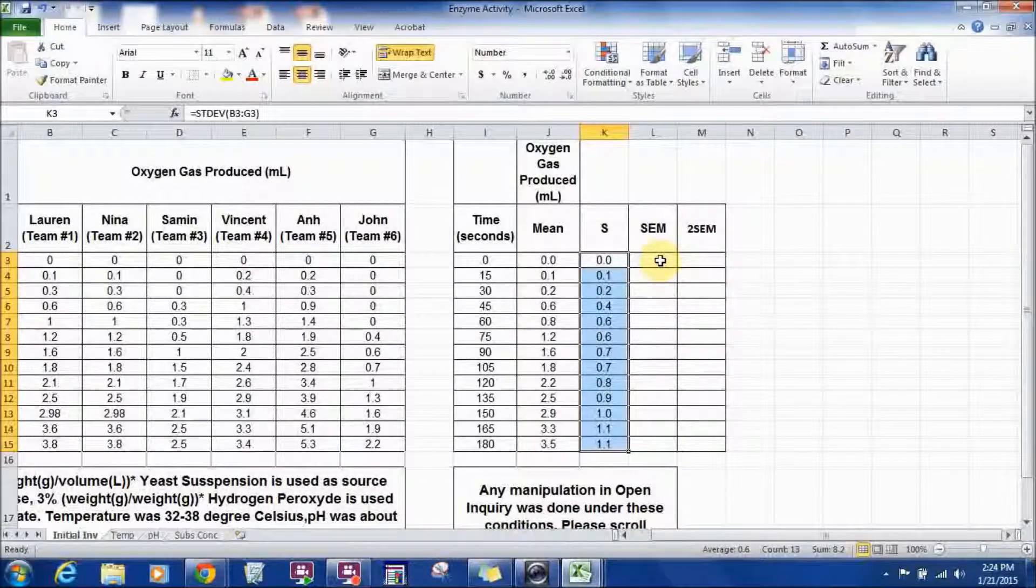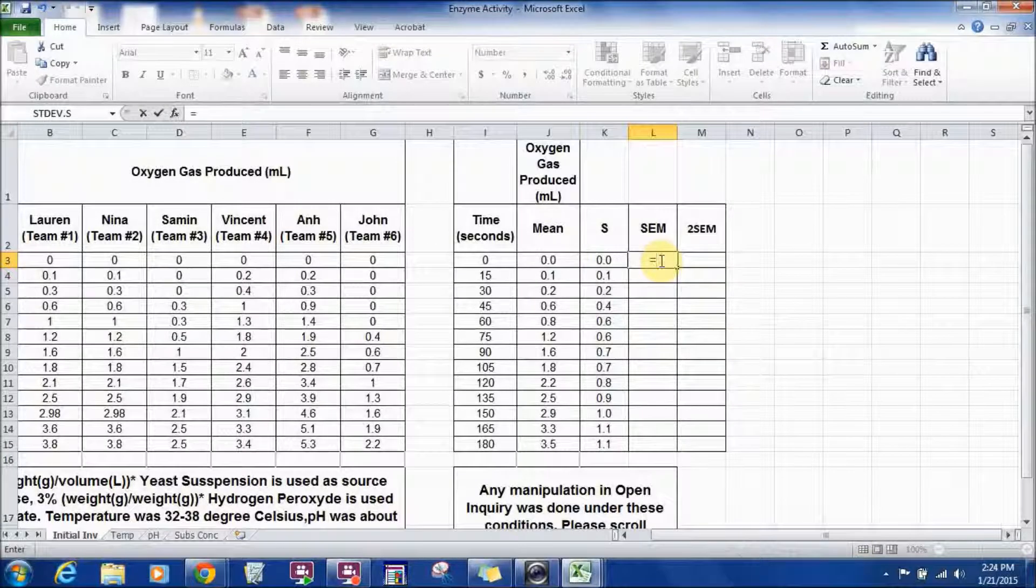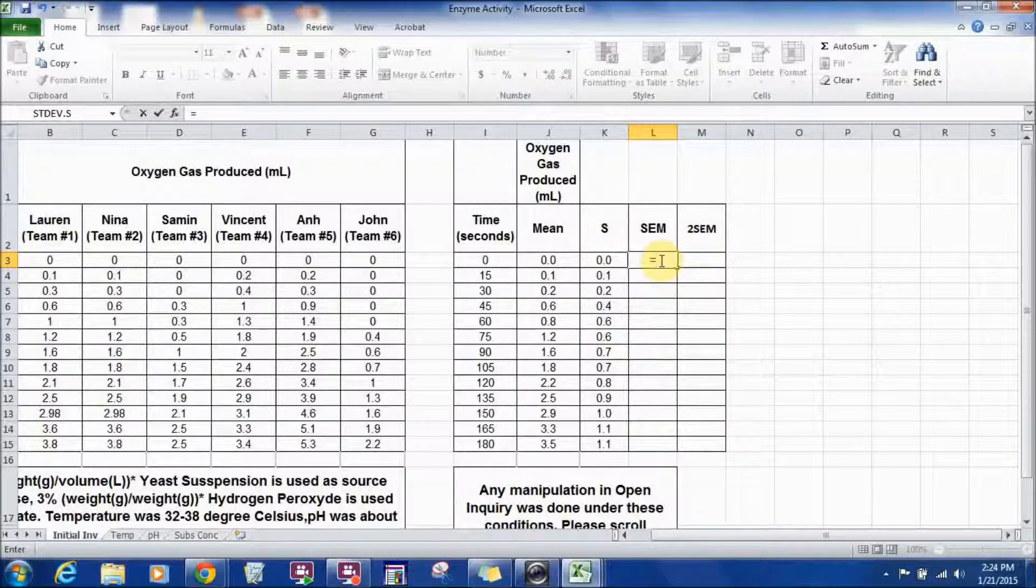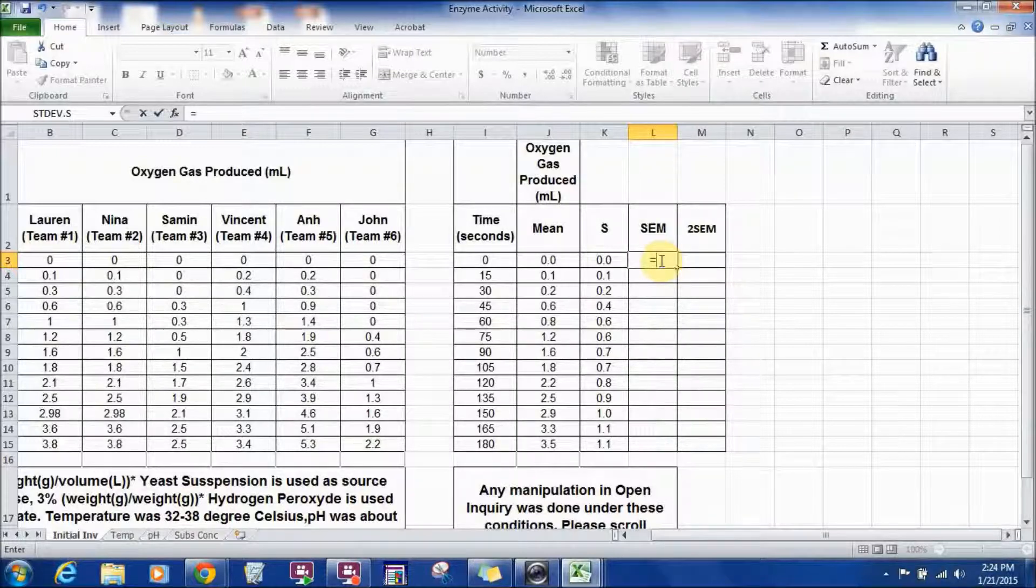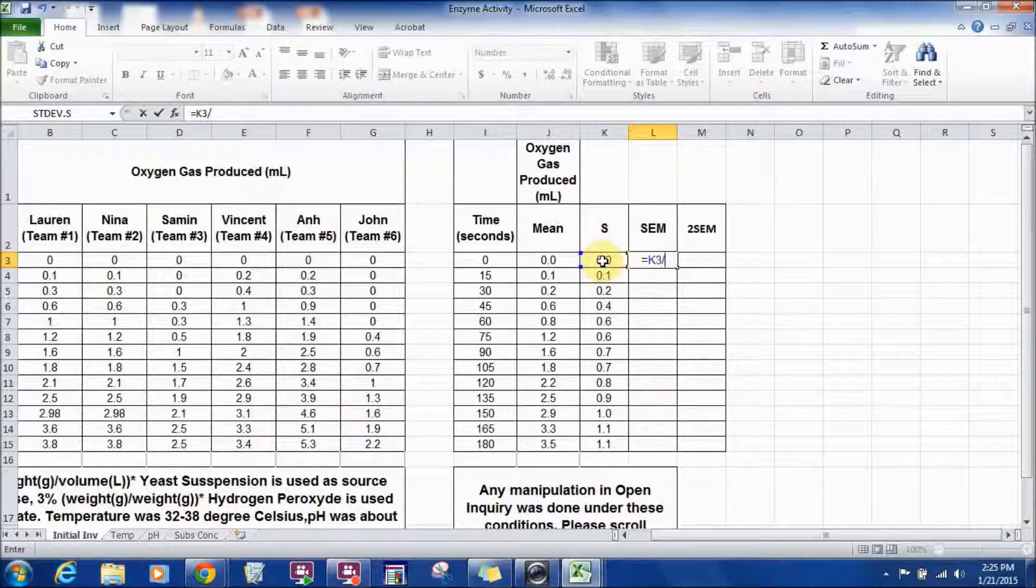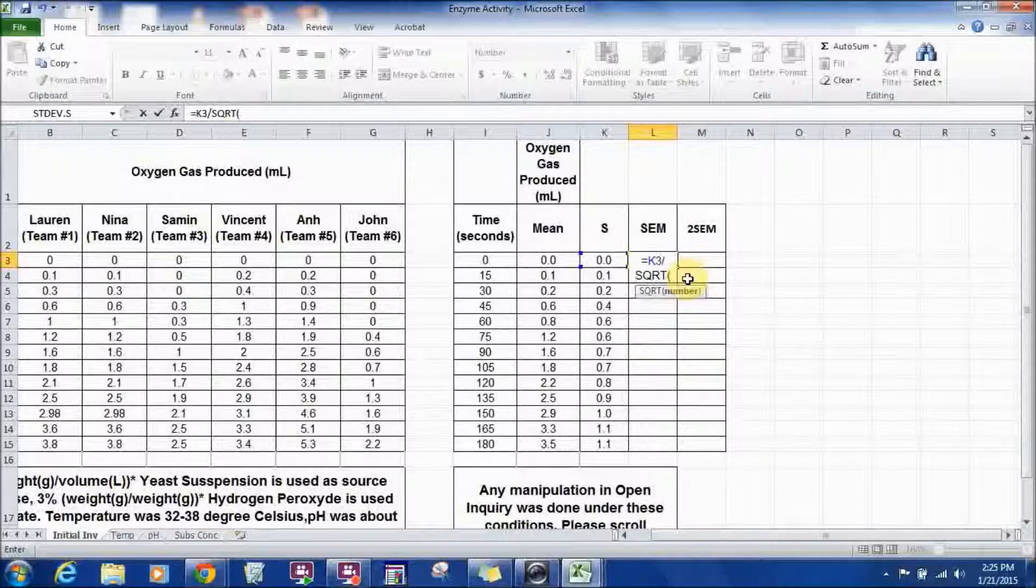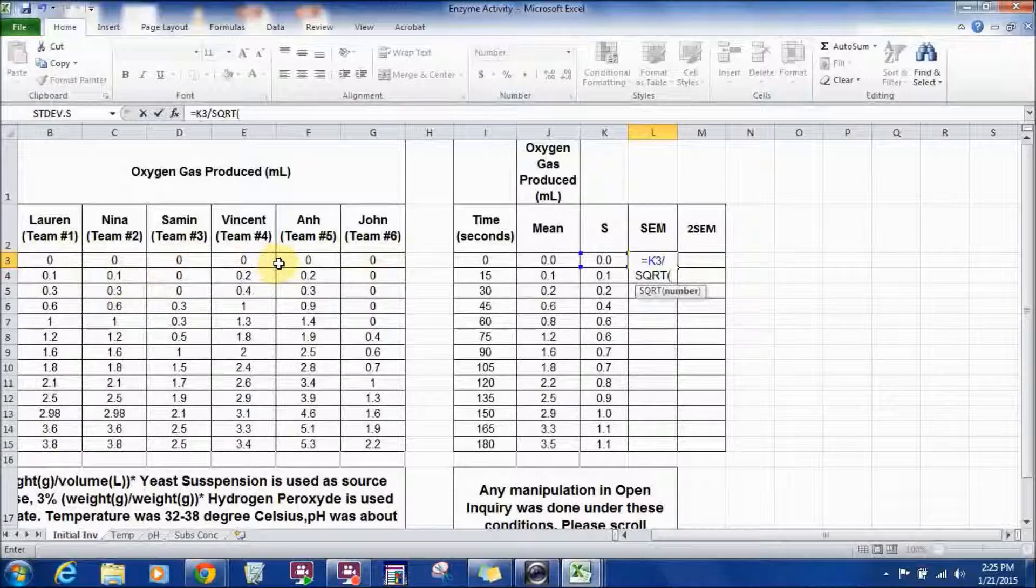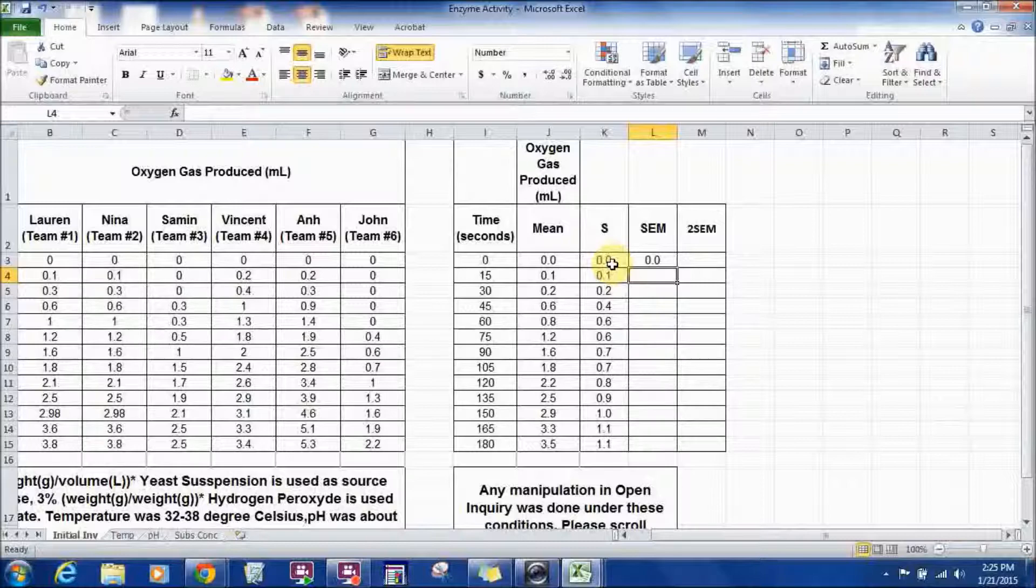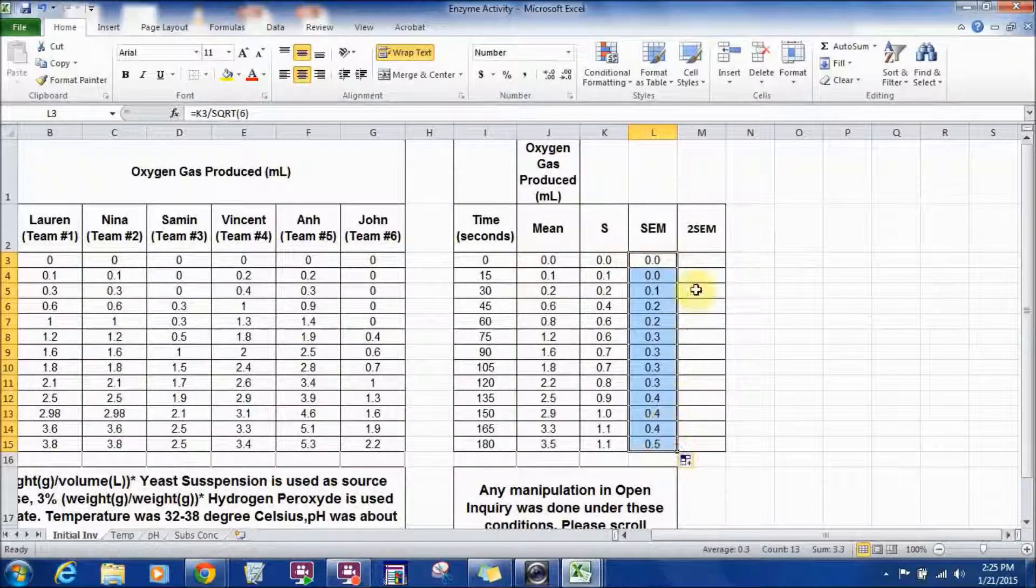Do the same thing for standard error of the mean. You have to enter the formula this time. It's pretty simple formula. It's standard deviation divided by the square root of sample size. So, this is the standard deviation for this row divided by the square root of sample size. The formula for square root function is SQRT. So, you double click on it to select. And then, your sample size is 6 because you have 6 entry or 6 trials or 6 samples. So, sample size is 6. Close parentheses and hit enter. That's the standard error of the mean for this row. And pull it down to apply the same thing for each other row.